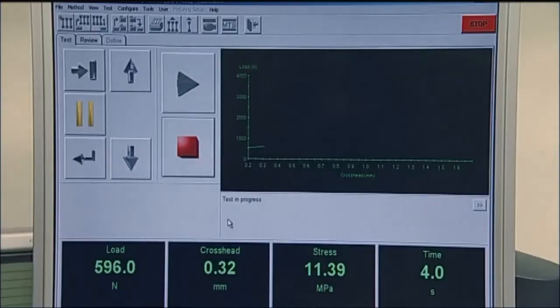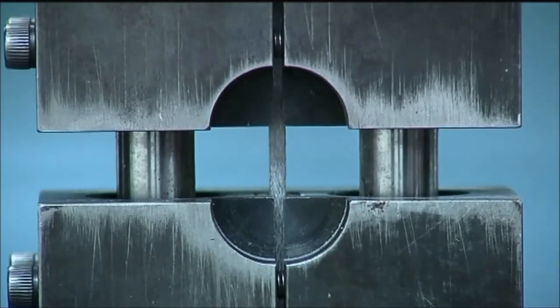The specimen is compressed through direct end loading at a uniform rate of approximately 1 mm per minute to failure.